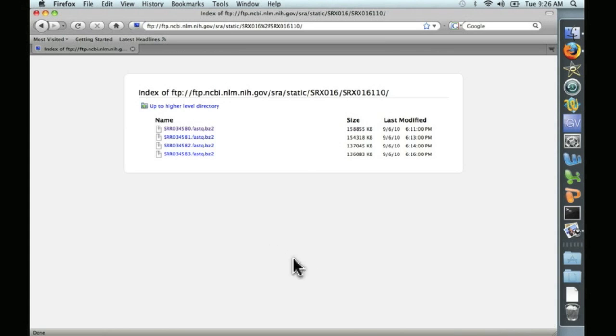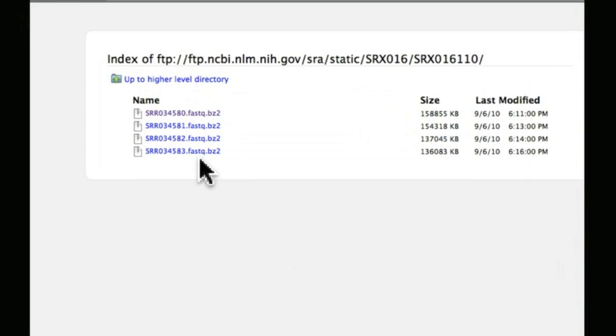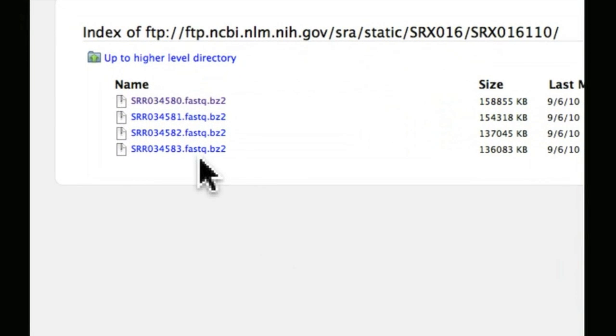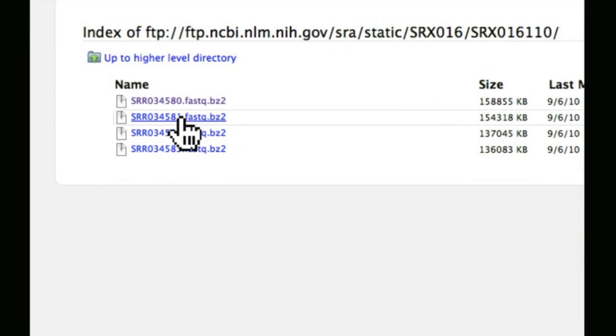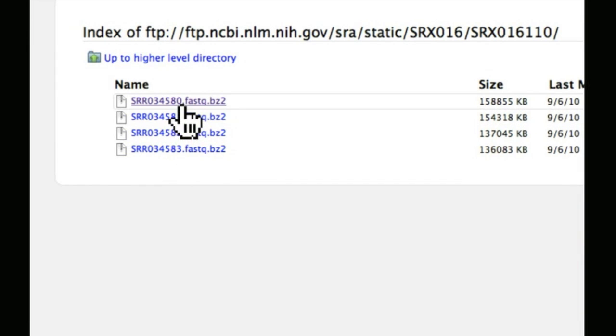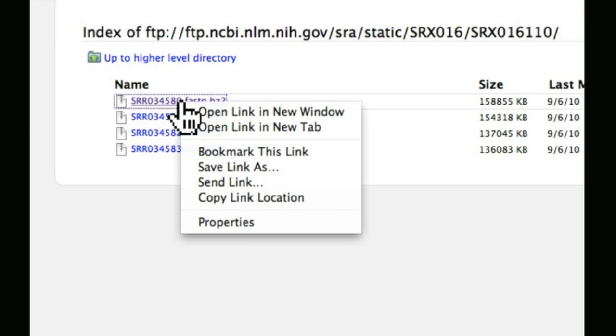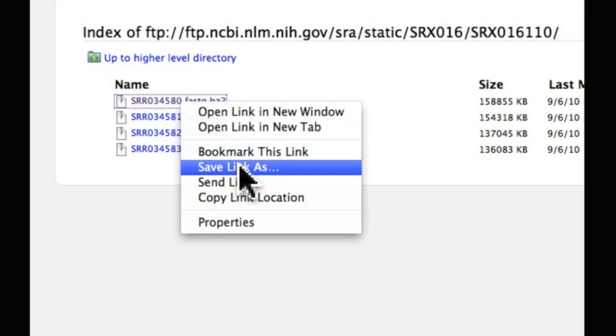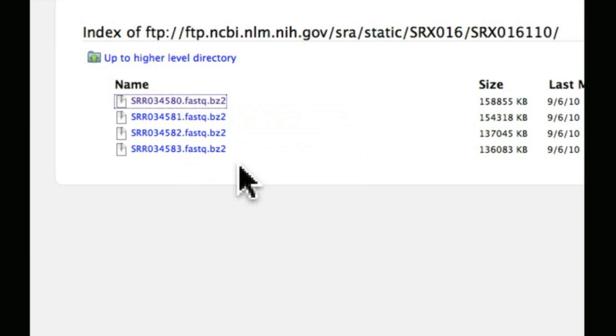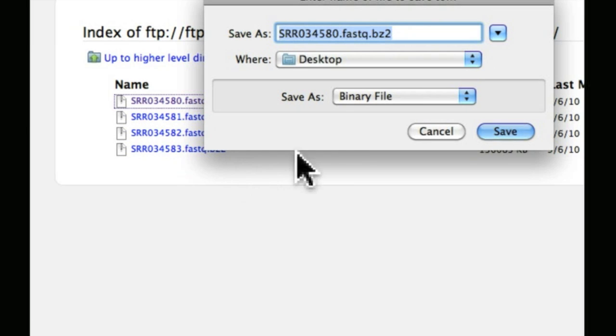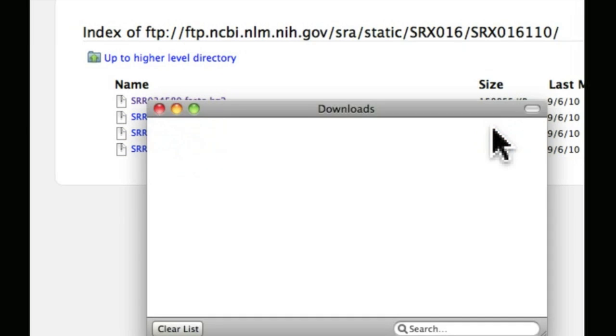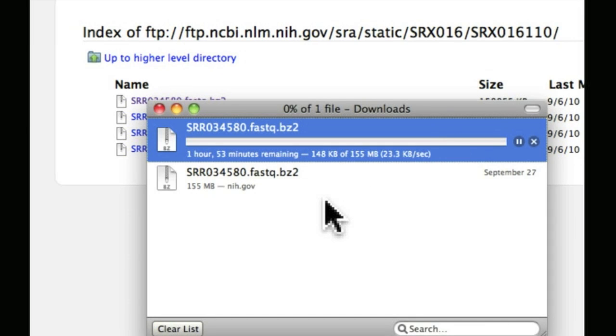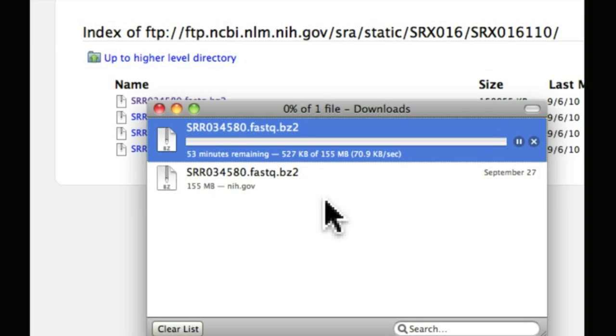And down here at the bottom, you have a couple different options for downloading. Go ahead and click on FTP. And this sample actually contains four different data sets. Because we're just going to use this as an example, we're only going to look at the first data set. We're going to right click on that and say save link as, and save it to our desktop. And now we're downloading the data. As you can see, this is going to take a while, so we'll be back.